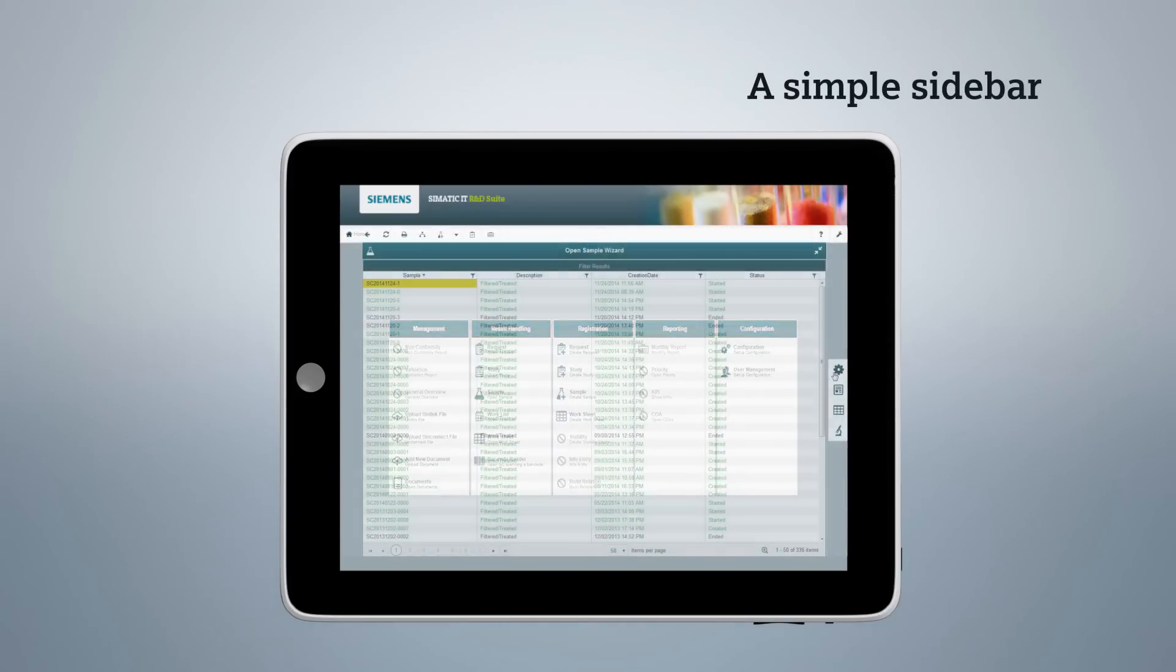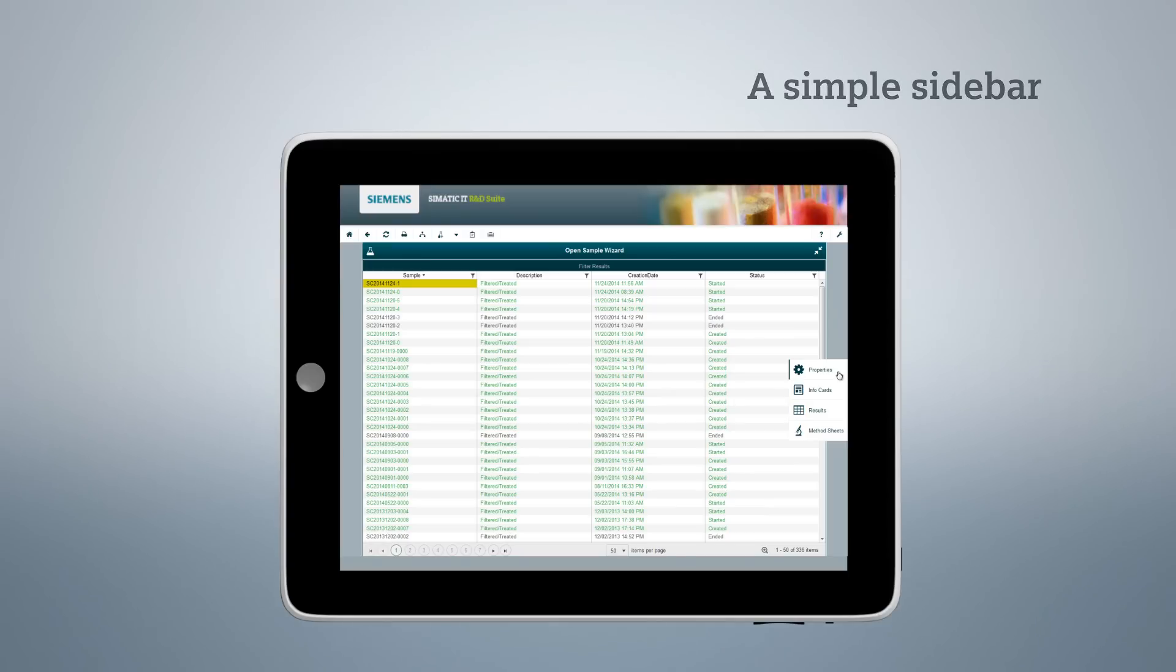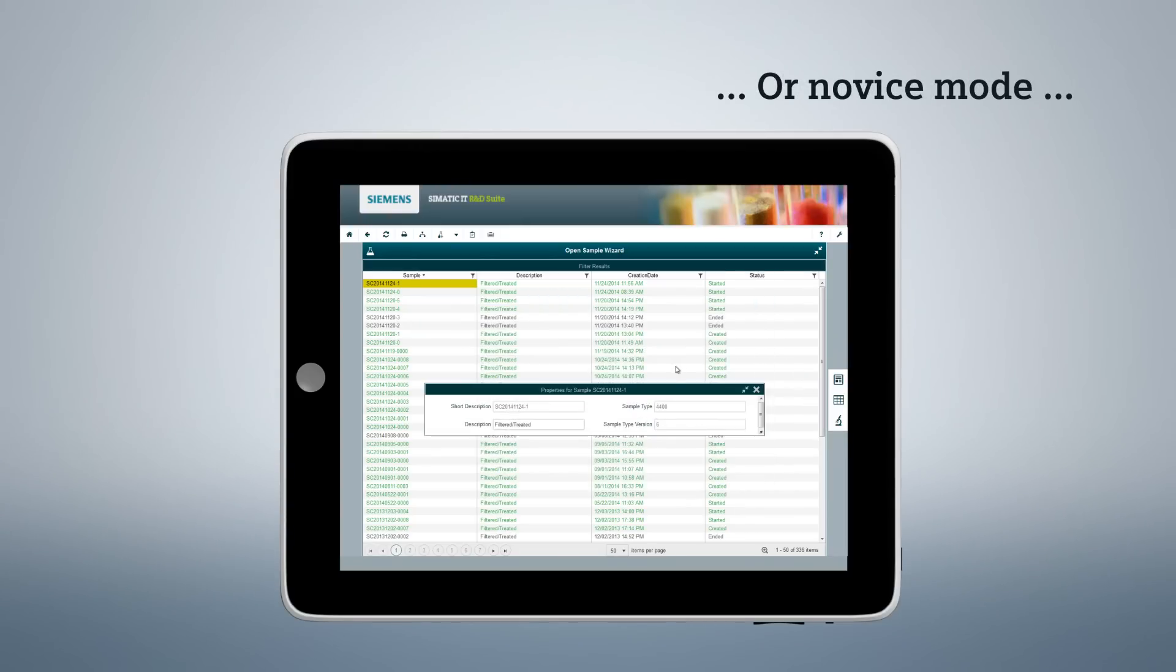The sidebar really puts you in charge of your tool with crystal clear action buttons. Do you choose to display those sample properties in expert mode? Or maybe you prefer the novice mode to avoid clutter on your screen?